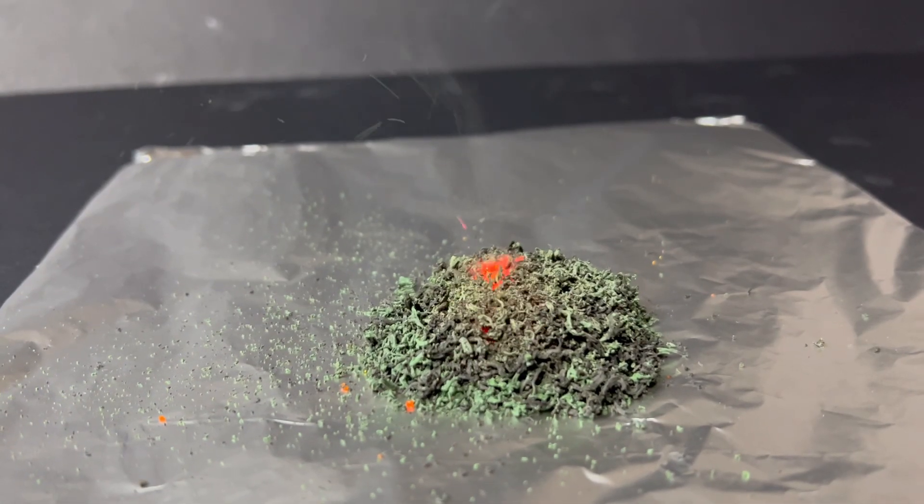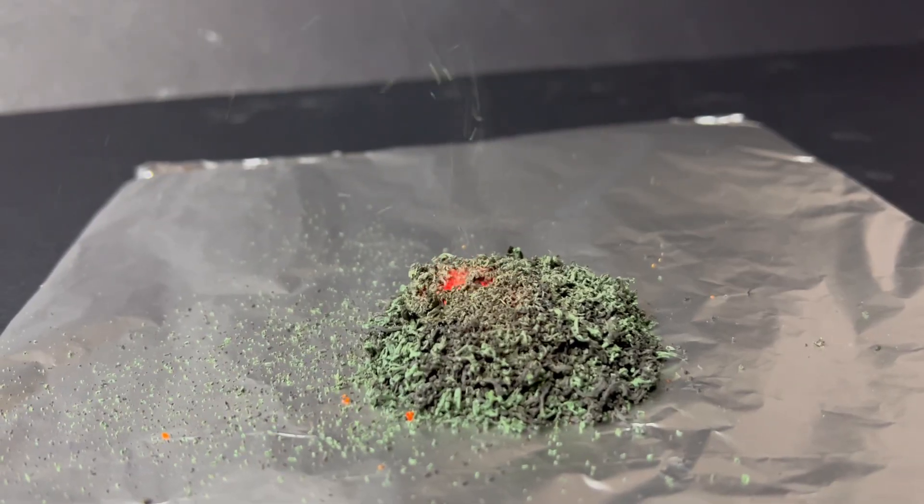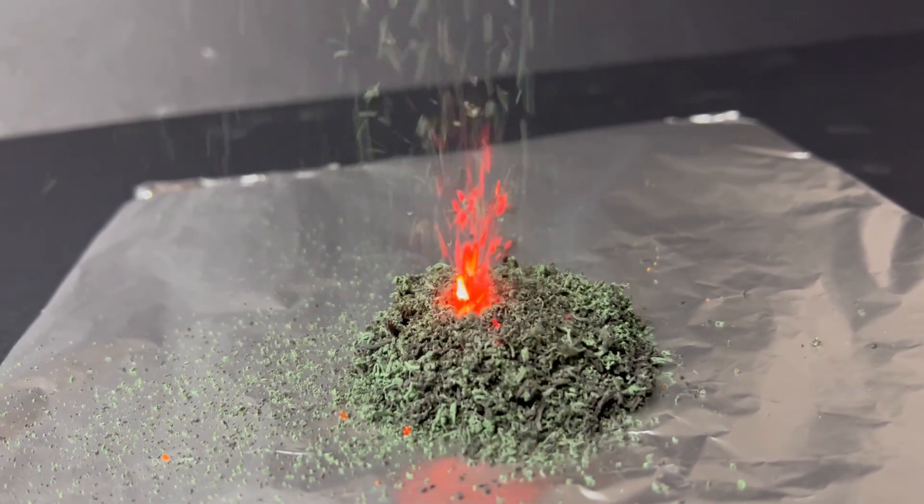The colour and texture changes clearly show that a new substance has formed, and the heat and sparks show that energy has been released.